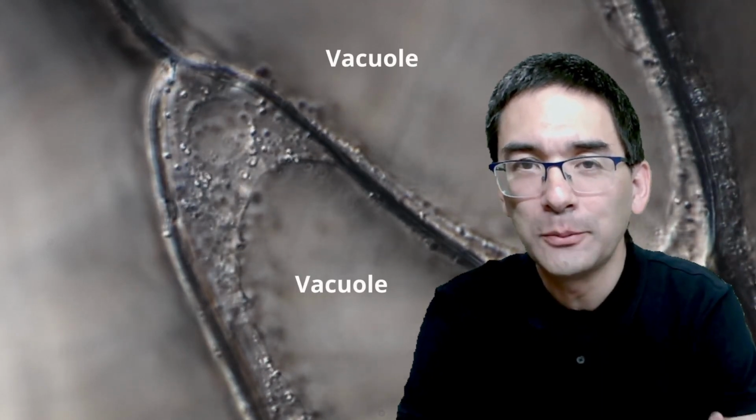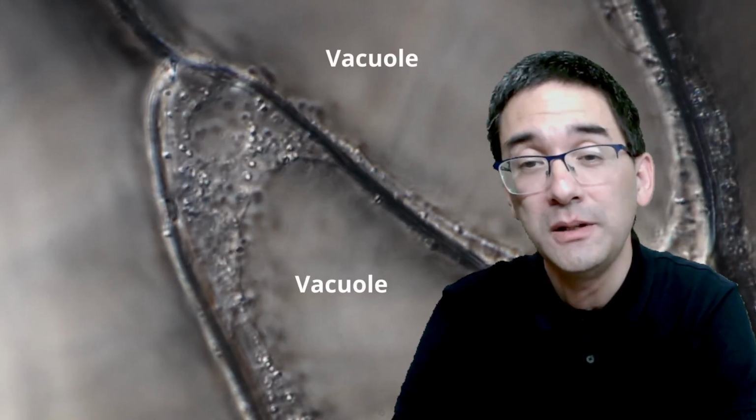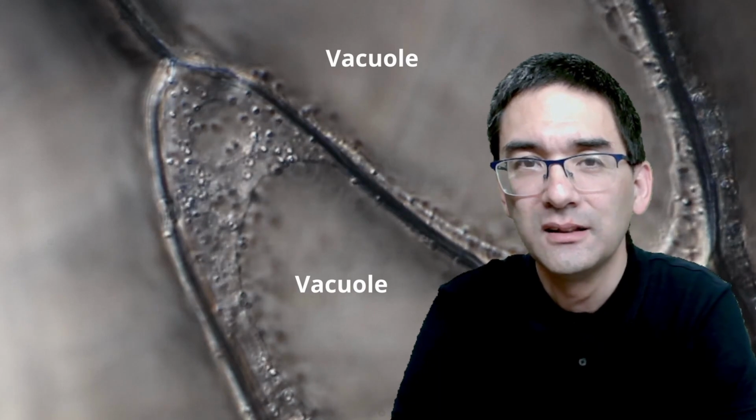You see it much better here on the other side. Those little dots that you see moving inside the cytoplasm are a variety of cell organelles and vesicles. I don't know if this round structure in the cytoplasm on the other side could be a nucleus, but I think not. I think even for a nucleus, it's still a little bit too small. So somewhere there's got to be the nucleus, pushed to the cell wall somewhere in the cytoplasm.